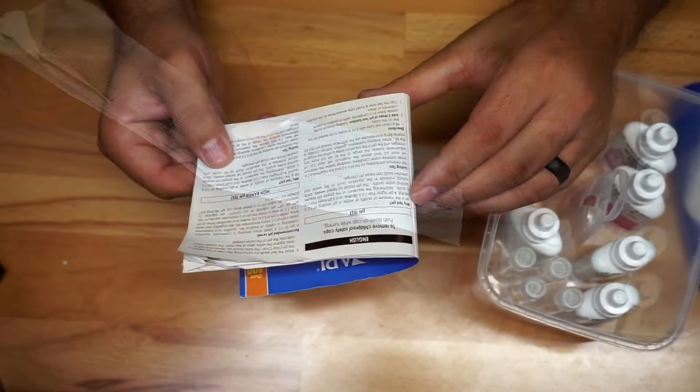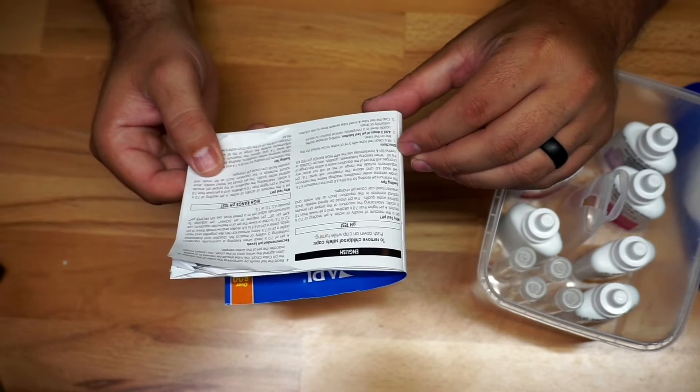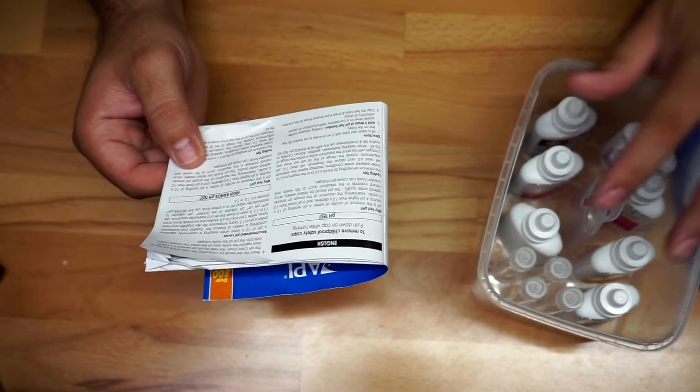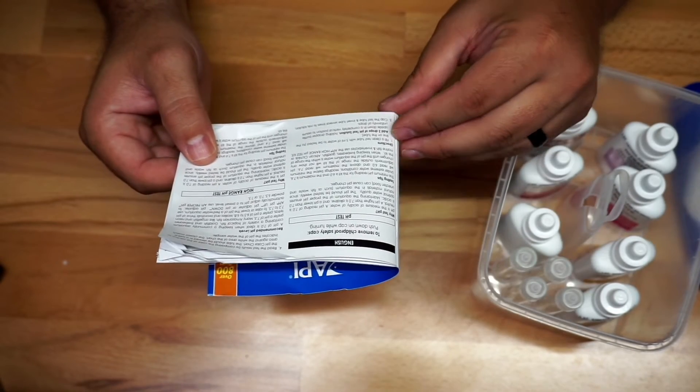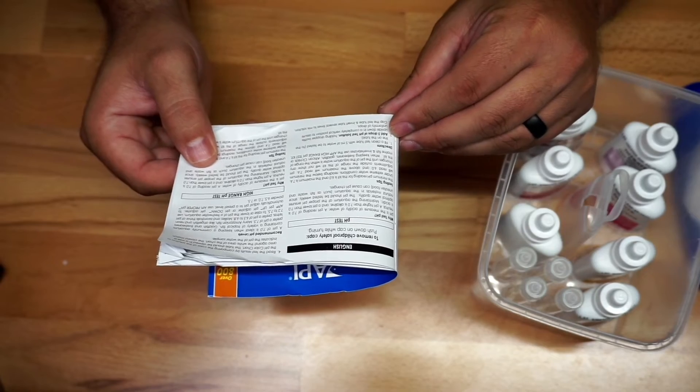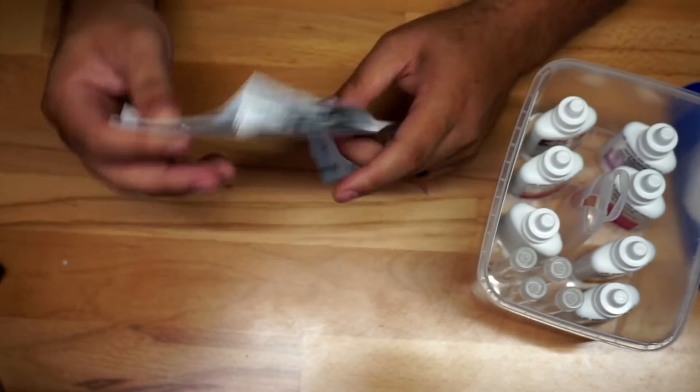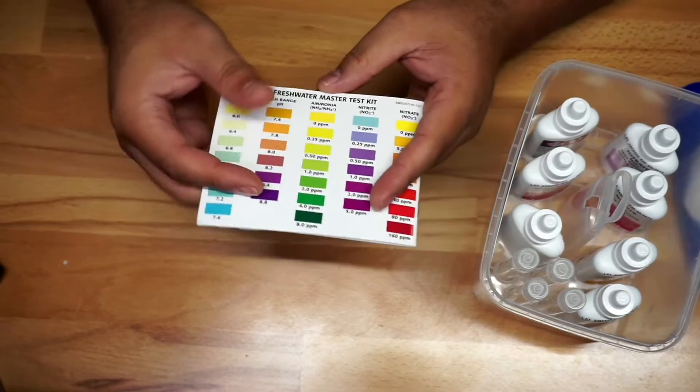So essentially it's very simple to use. For example, I'm going to come up here where it says directions. For the pH testing tip directions, obviously you got to fill one of these bottles, drop several different drops in there, add three drops to the pH test, and then you follow the instructions.